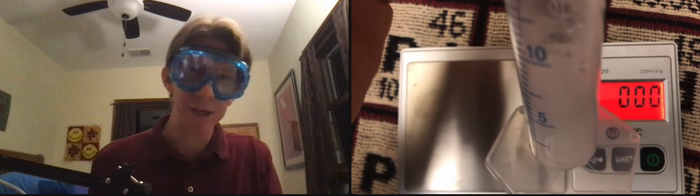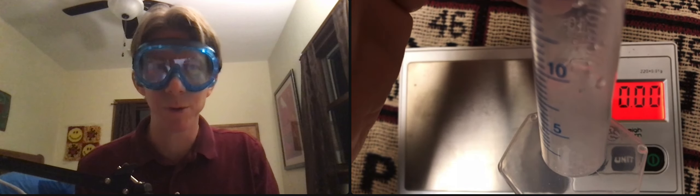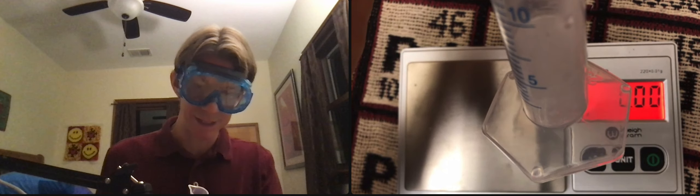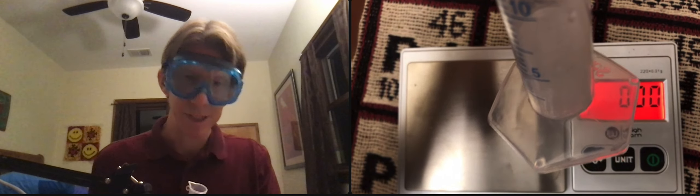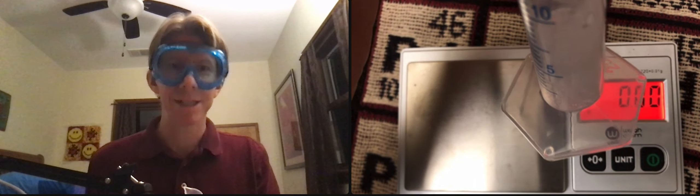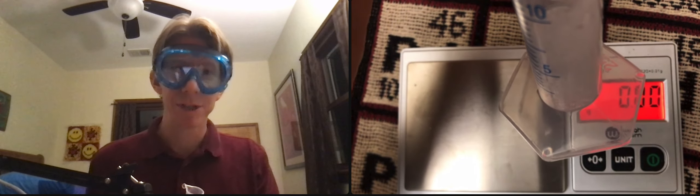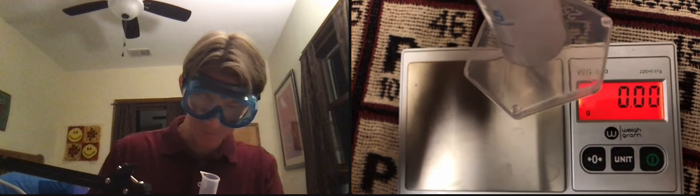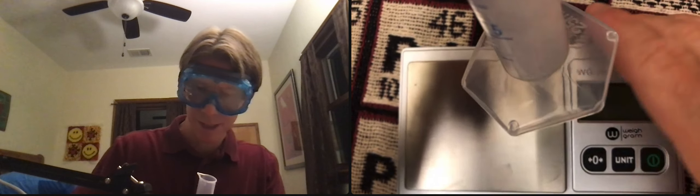And I thought about doing an experiment where we tried to capture the hydrogen gas and do an experiment with that. But that turned out to be trickier than I thought. So what I'm going to do is I'm just going to set this aside for 20 to 30 minutes.